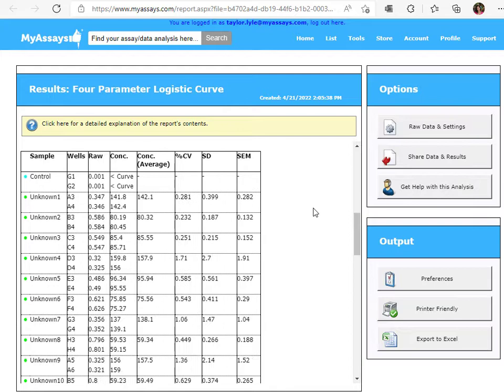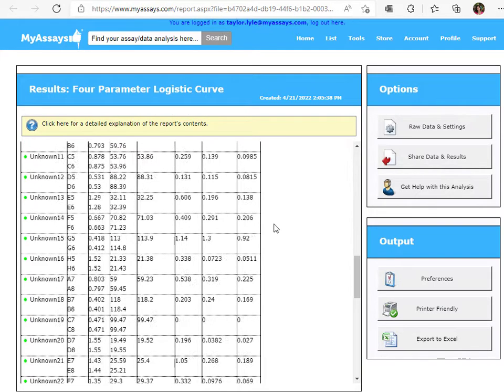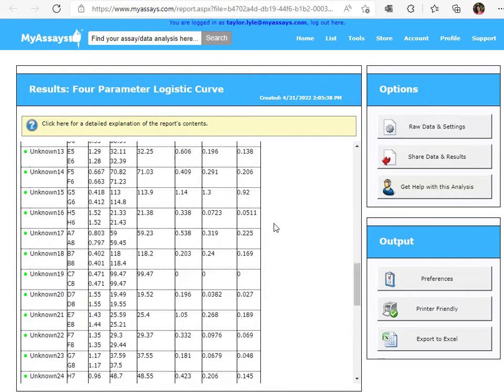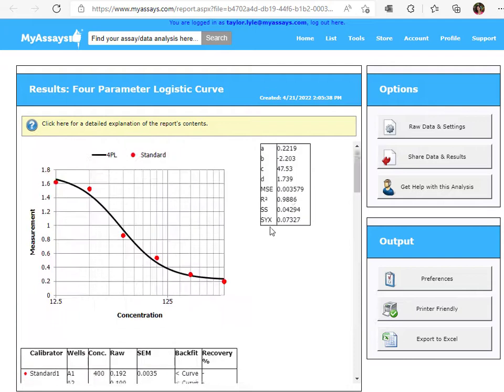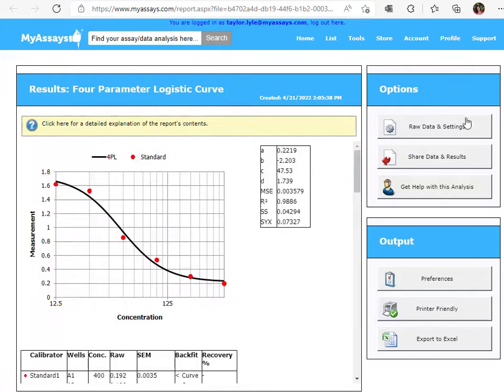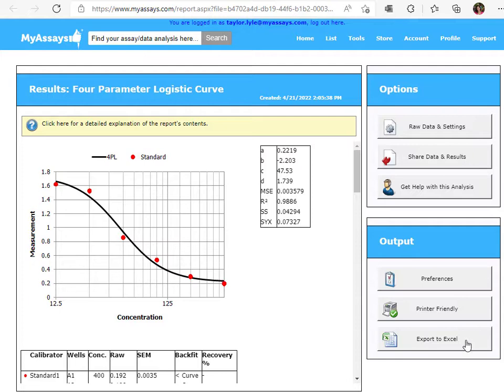Below the curve data table is the sample table, containing the calculated results for control and unknown samples. By using these options to the right-hand side of the screen, you can share data and results through the creation of a unique link, export to Excel, or create a printer-friendly version of the report.